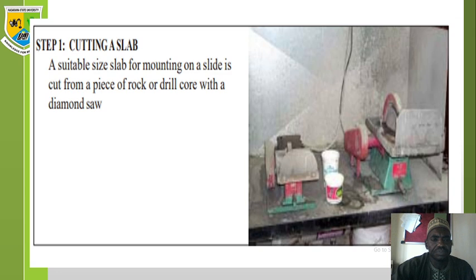First step, cutting a slab. A suitable size slab for mounting on a slide is cut from a piece of rock or drill core with a diamond saw. You can see the arrangement of the machine for that purpose.